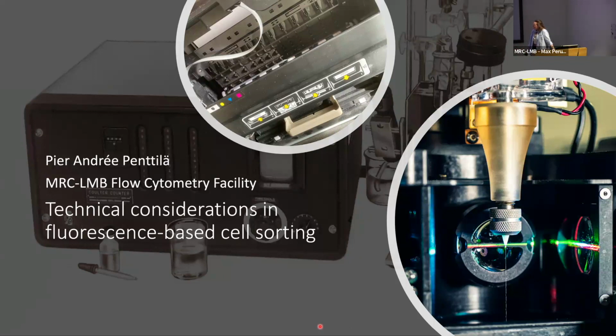The first slide here, I would just like to point out that there were multiple different technological implications in the advancement of cell sorting specifically. And one of those is actually an inkjet printer, and I'll talk about that a little bit later. We also have a Coulter counter here, which was developed by Walter Coulter to enumerate cells. And then we have an image of a modern day sorter at the intercept point with, of course, the addition of lasers so that we could read fluorescence on cells.